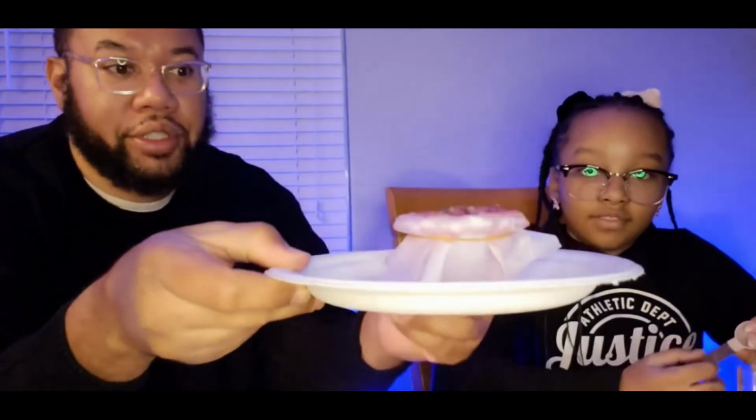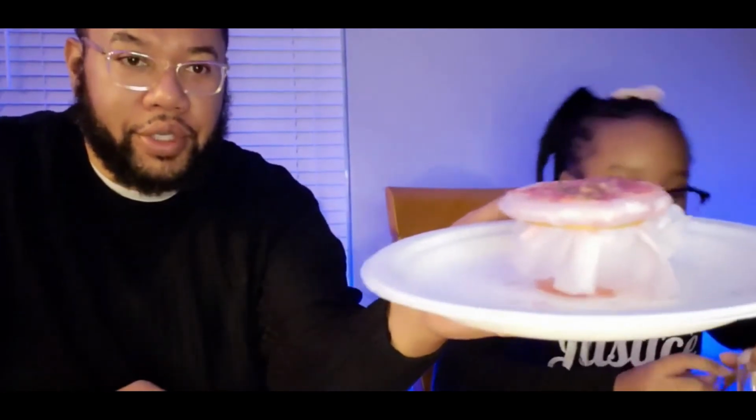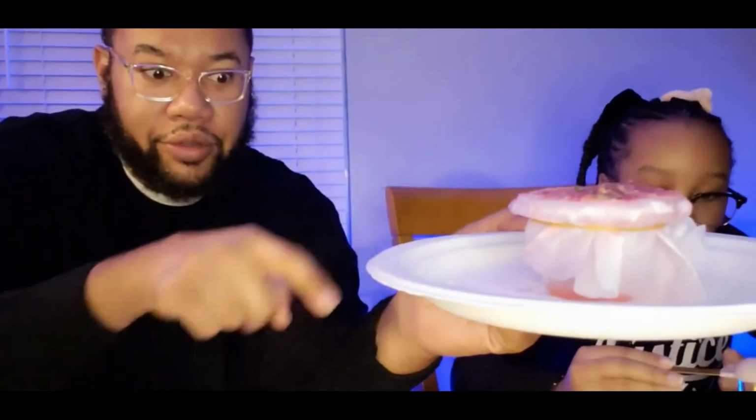All right, guys. We're back. Yep. So we've let the strawberry in the solution, we've let it filter through here. As you can see down here, this is the product that's drained through. And next we're gonna move on to the next step.